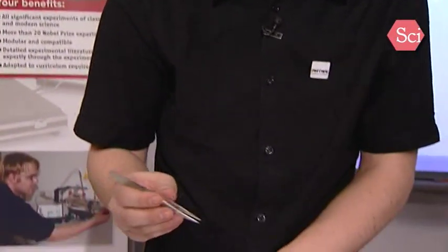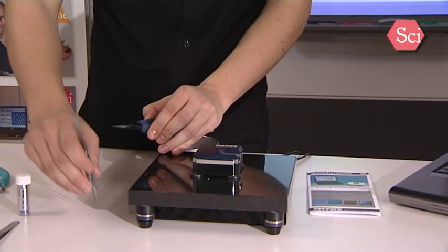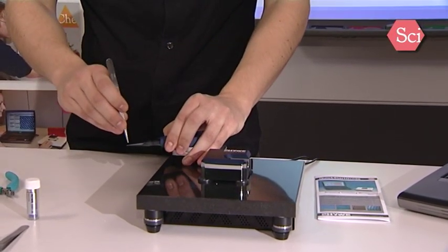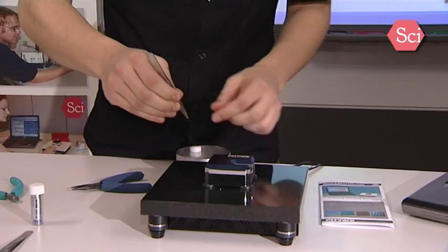Now take the tweezer to get rid of the old measurement tip. Take out the old one. Now take the freshly prepared tip and use the tweezers to install it in the system.